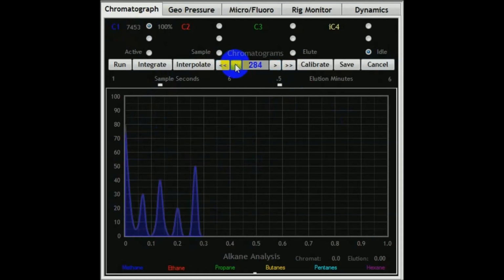So once we've reviewed the others, we can go back and say there's something wrong with this one. Let's either reintegrate it and leave it out, or we're going to reintegrate it, finish the job here, click interpolate, and put those percentages in the database. Had we left a plain gray curve, this would be overlooked by the software that creates the LAS function. We feel the user needs to have this kind of flexibility because automated systems often throw errors. We've seen some very strange things on logs done by semi-automated systems that were confused.